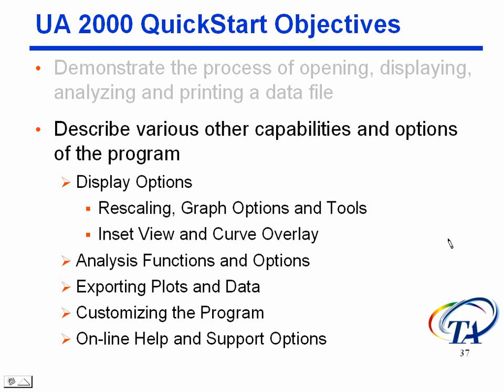When you're considering how to display the data, okay, there's various functions that you can use for rescaling data. Okay, so we'll get into that a little bit. Then there's graph options, which allow you to control things like attributes of the plot, like the curve color, the curve line type, whether you use symbols and stuff like that. Those are actually pretty powerful too, because you can save those for different axes, can have their own options, and different instrument types can even have their own options.